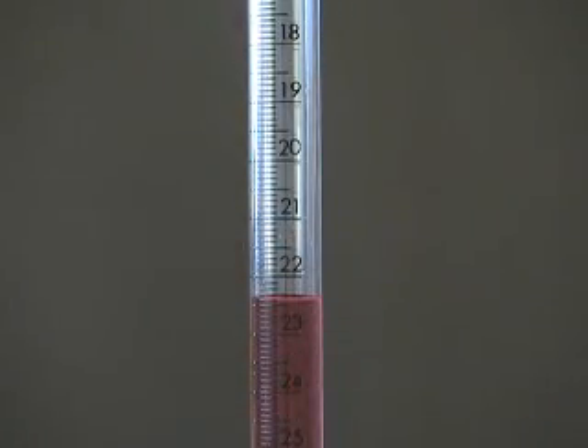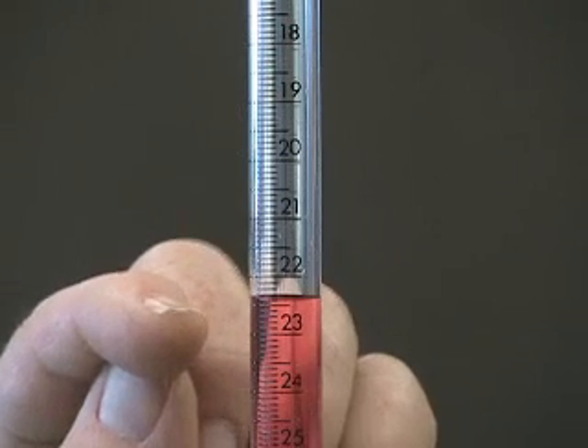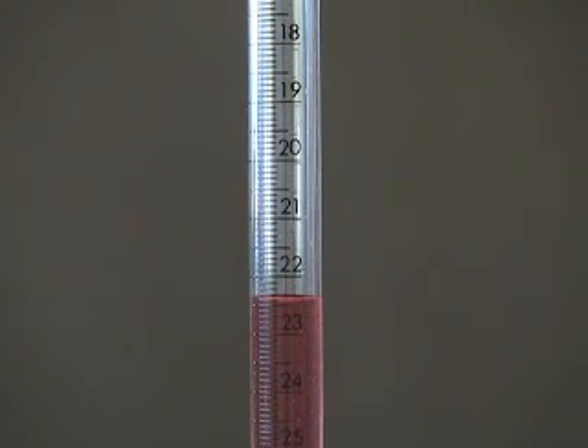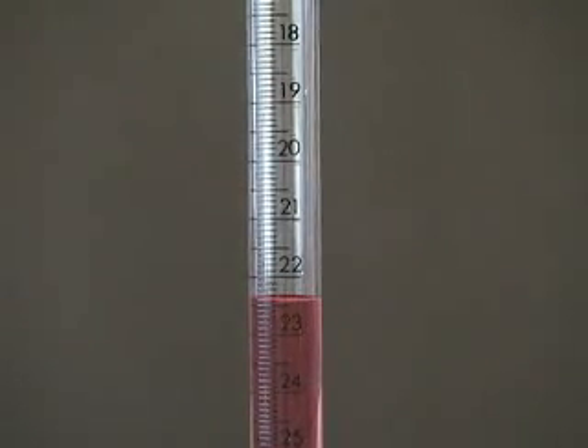So let's drain some out and show the volume at another location on the burette. Burettes have a valve at the bottom, and that's what they're used for — to deliver small, carefully measured volumes of liquids. If I drain some out, let's try having you read the volume on this burette at a different place.